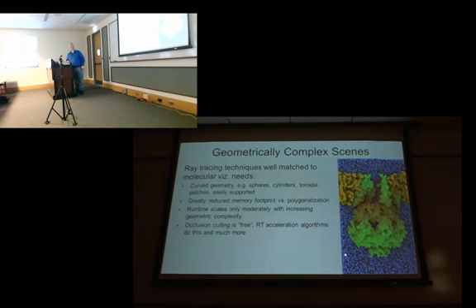And the other thing that you get out of it is much higher quality lighting. Like this kind of rendering here where you see all the water molecules, you can see that they look round. You see some depth to them, and then you can see some gradation where there are little pockets and cavities. These are things that are trivial to see in this ray traced image, but to do that with OpenGL would be nightmarishly difficult.